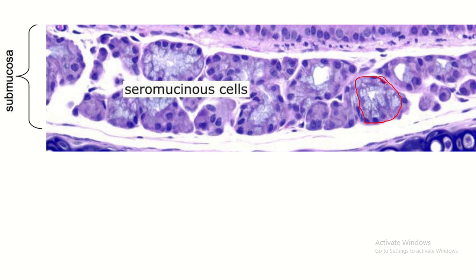This is a mucous acinus. You can see there is a whitish area, the nuclei are basally placed and flattened — flattened due to the thick mucous secretion. It looks white because during histological slide preparation, the mucous secretion is washed out, so these acini always appear whitish.